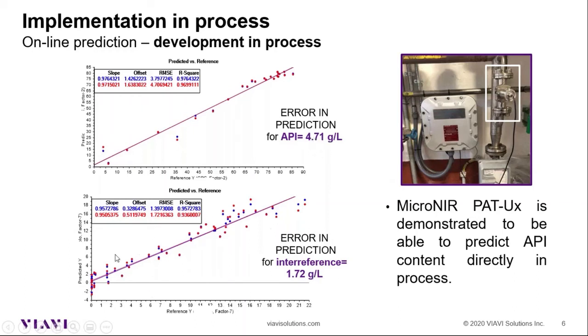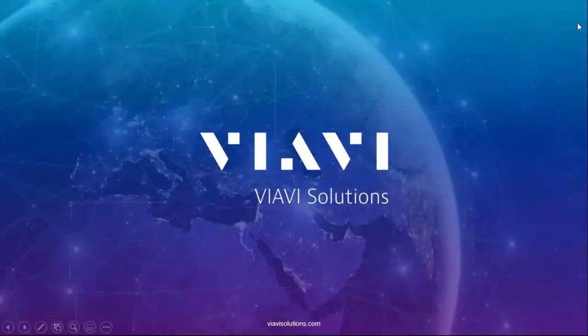I also show you this reference versus predicted value of one of the two interferents, the byproduct. So you can see that not only are we able to detect the byproduct, but also to evaluate its concentration. So we can confirm that the MicroNIR PAT-Ux was demonstrated to be able also in process and online to evaluate this liquid sample that contains the API. With this, I think that we can pass to the agro food and feed application.